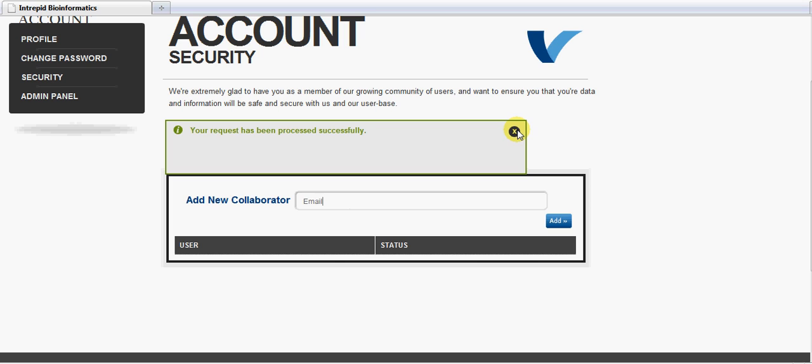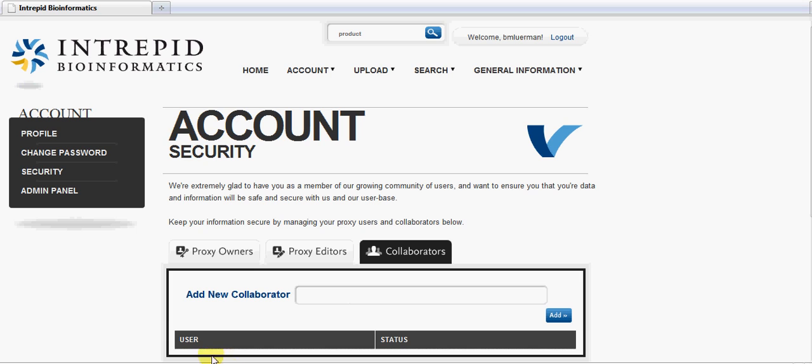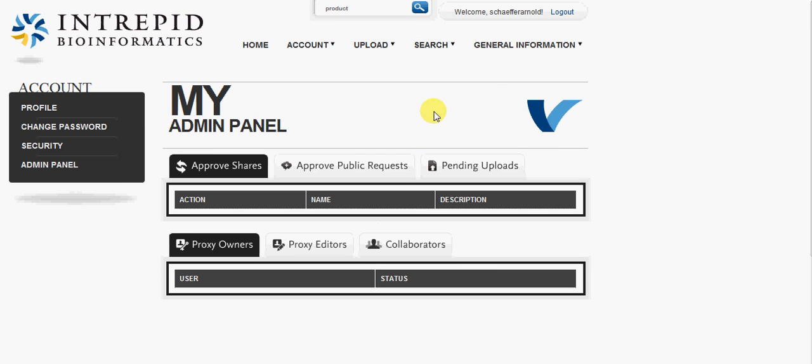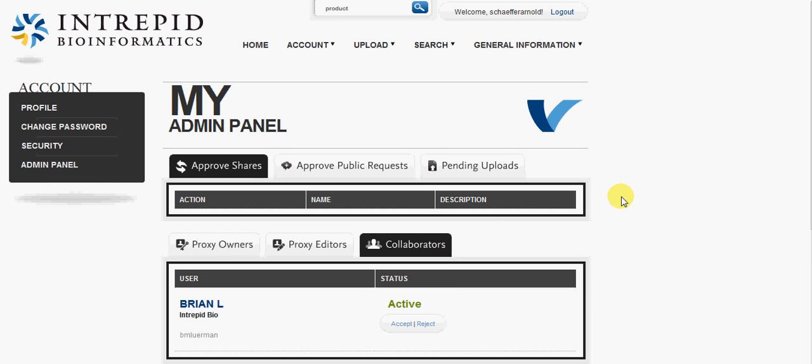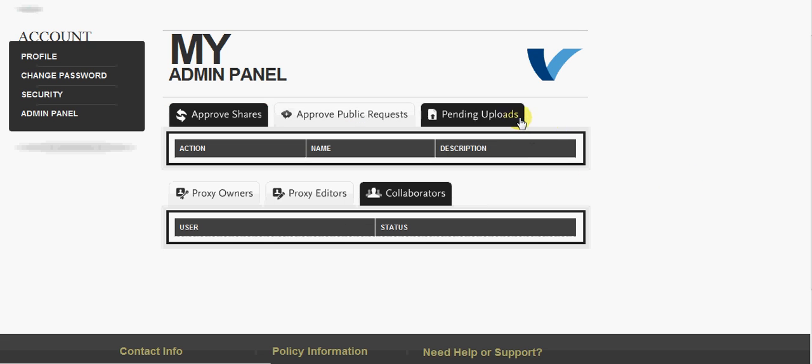I'll get a confirmation saying that it was successfully done. Schaefer will then get an email requesting that he join me as a collaborator on the website. I've already taken the liberty of logging in as Schaefer. So once we refresh the home page here, he can click on the Collaborators tab, and we'll see that there is a request. You can choose to accept that, and it will be confirmed.